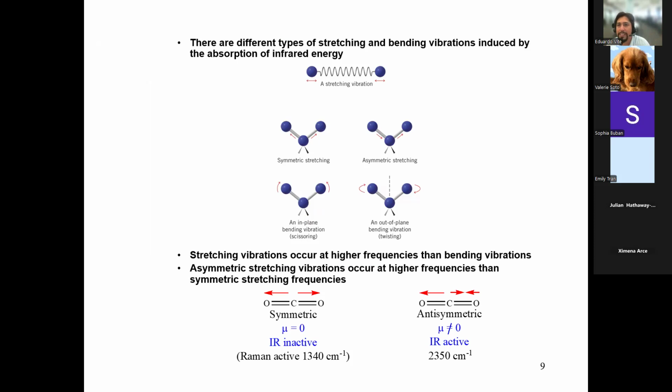So the molecules are vibrating in all sorts of different ways, and we can observe the wave numbers of those vibrations in our IR spectra. All right. And again, the wave number corresponds to the energy of those vibrations. Higher energy wave numbers have higher numbers, right? Big number, big energy. Small number, small energy, right? Big wave number, big energy. All right.